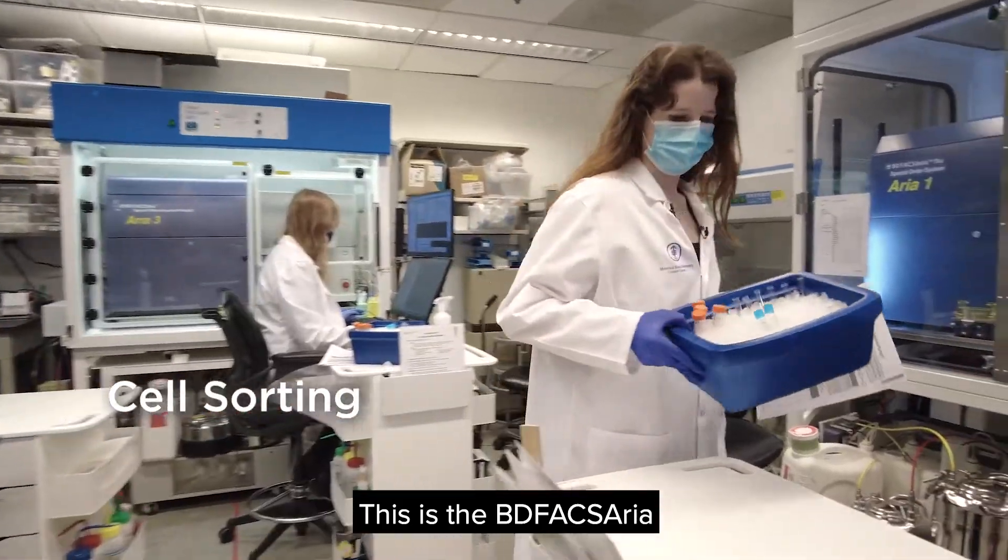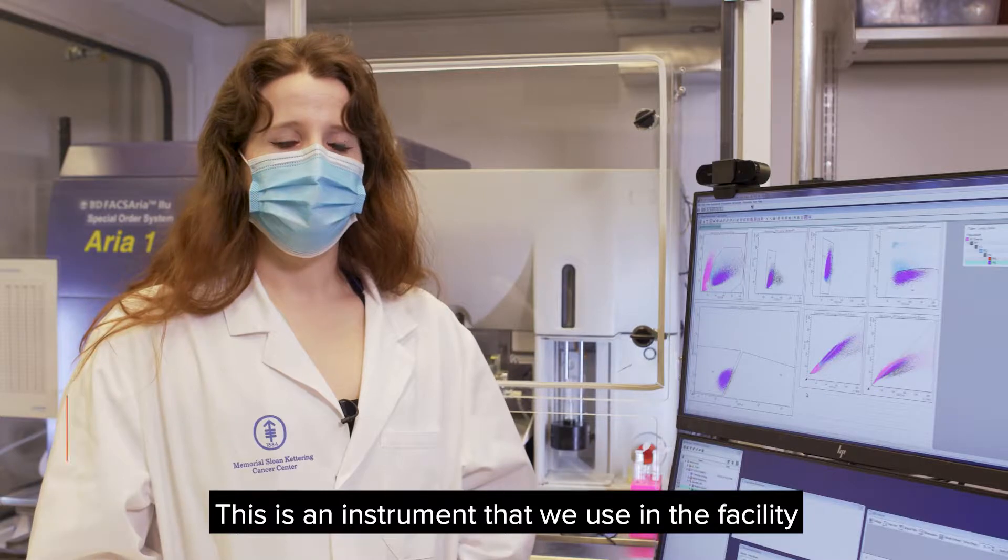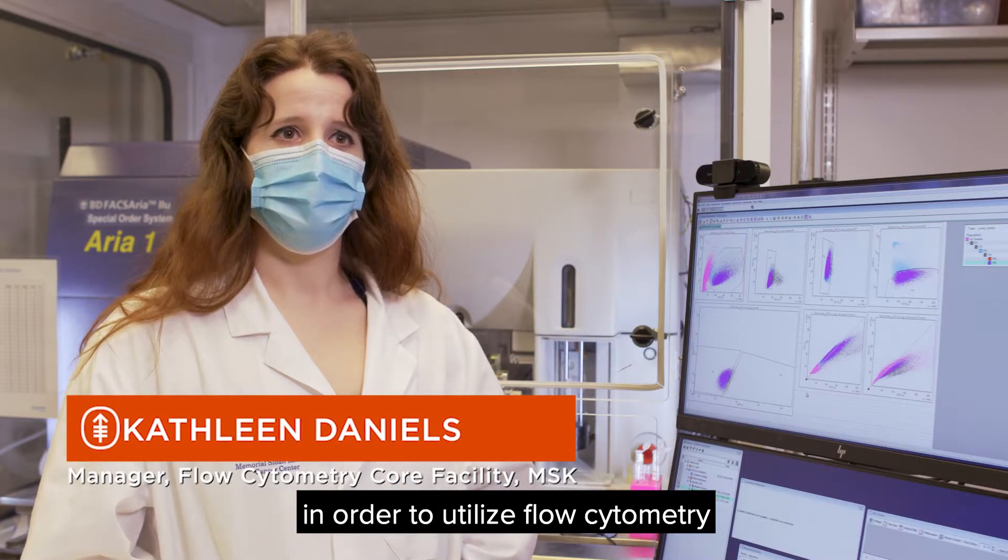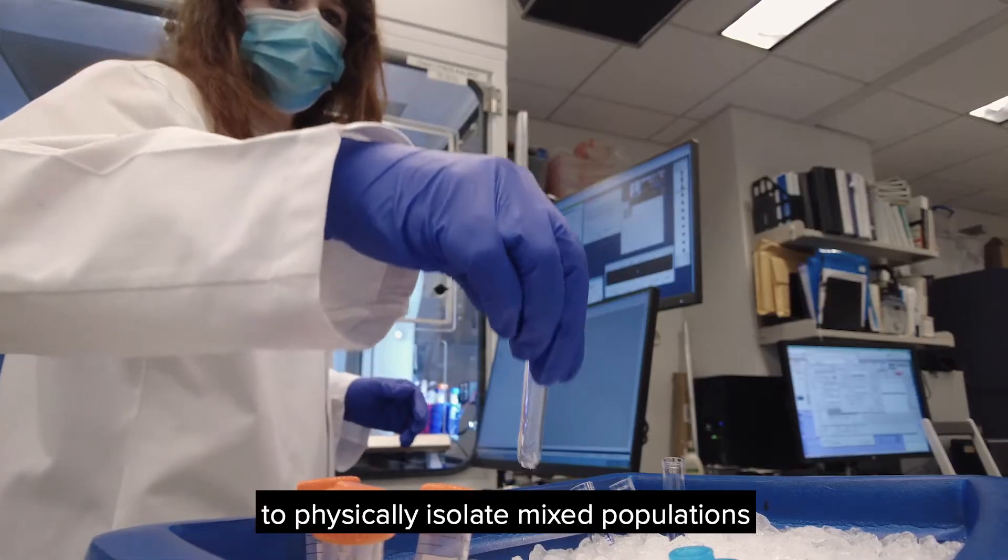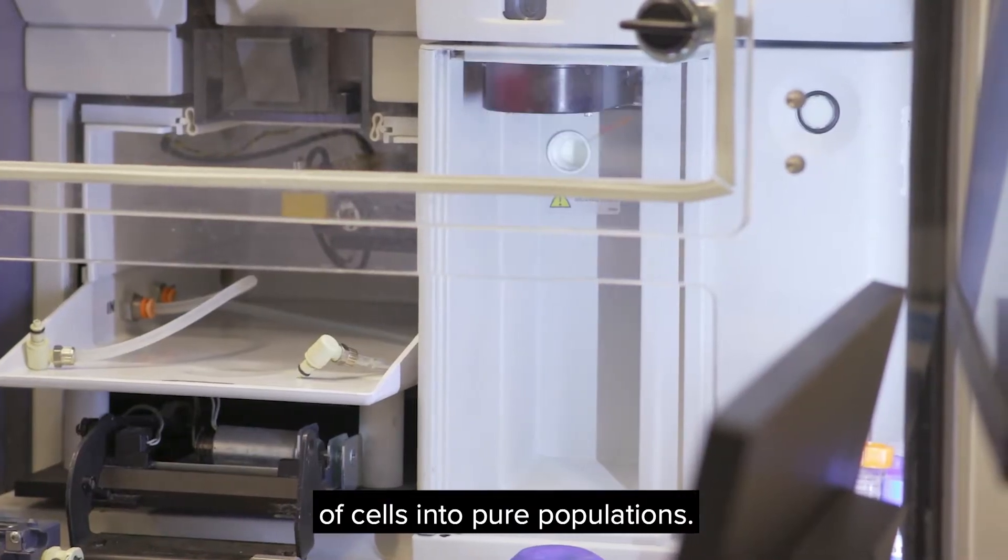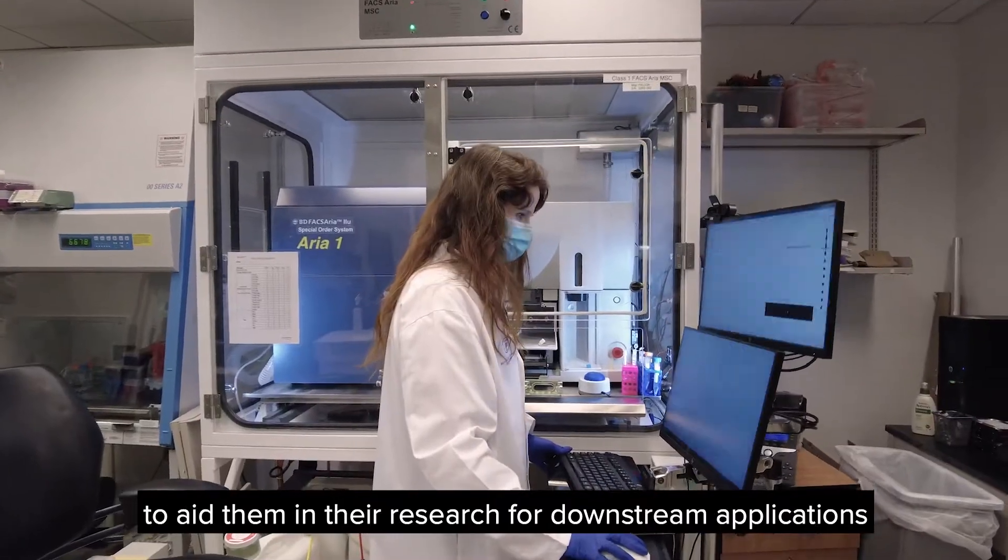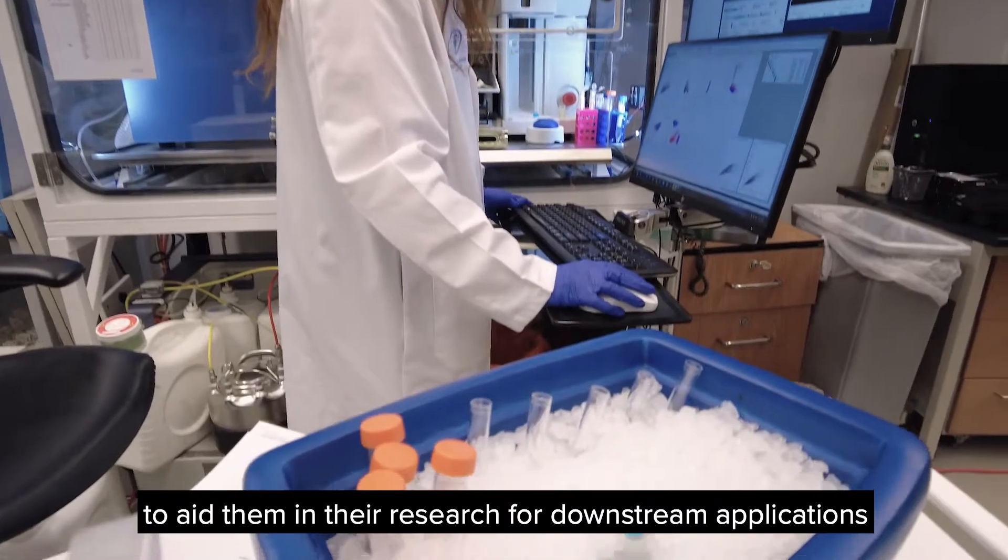This is the BD FACSAria here at the flow cytometry core facility at SKI. This is an instrument that we use in the facility in order to utilize flow cytometry to physically isolate mixed populations of cells into pure populations. This technology can be used by researchers throughout SKI to aid them in their research for downstream applications such as cell culture or sequencing applications.